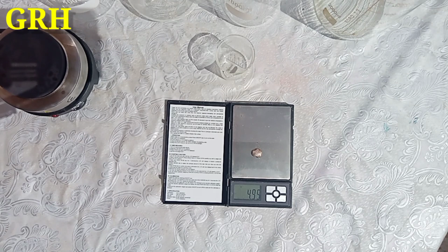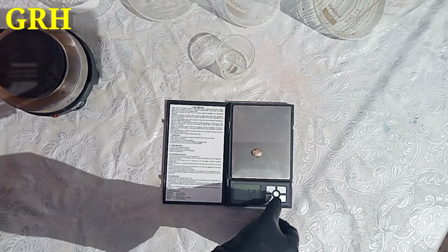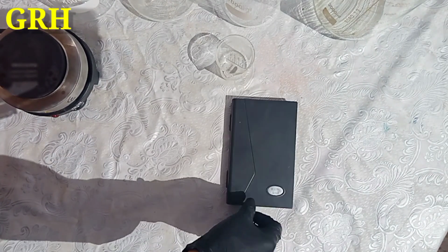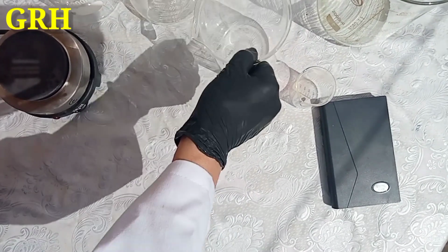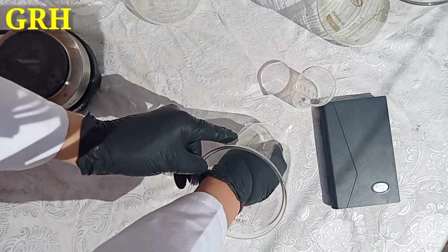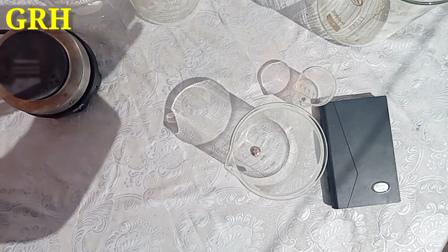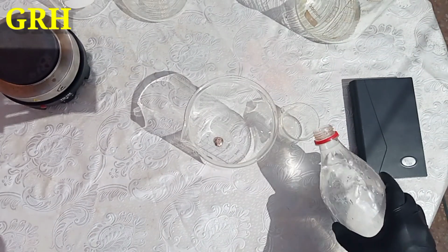Take a very small piece of scrap alloy. Suppose that you are extracting or refining some scrap metal that you had thought was a simple alloy of copper and silver. Add a solution composed of equal parts, by volume, nitric acid and distilled water, 1:1.